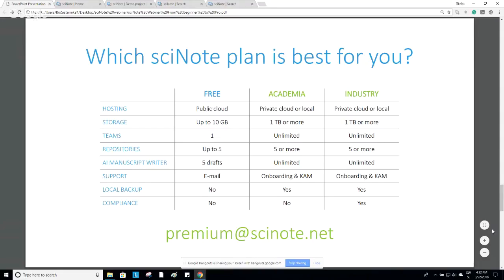So local installation has some limitations. At the moment, it is not possible to install it, but you can schedule a meeting with our premium team, and they will help you to answer this question and give you possibilities also for this.